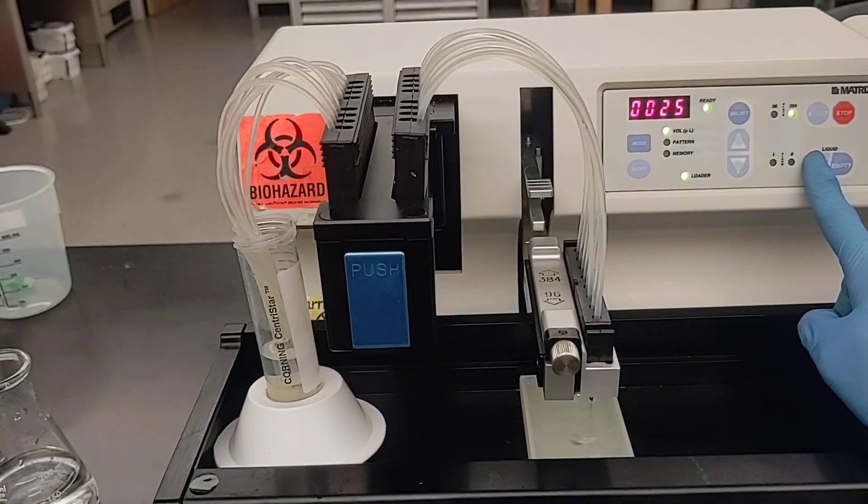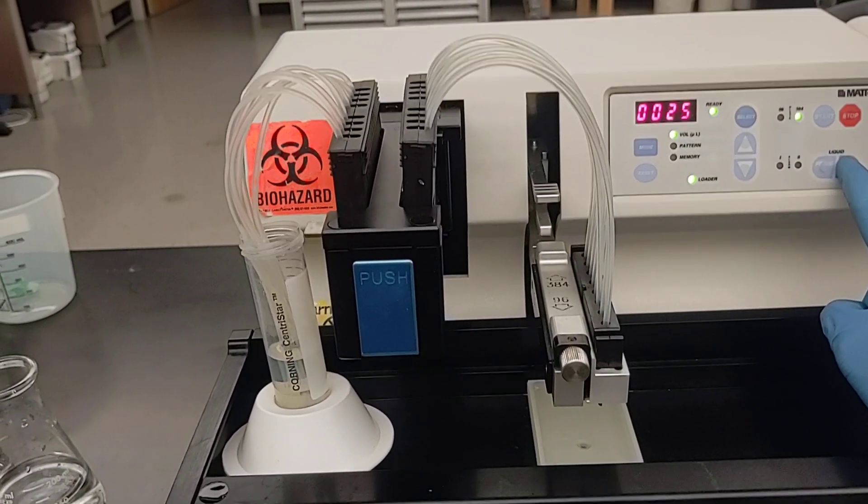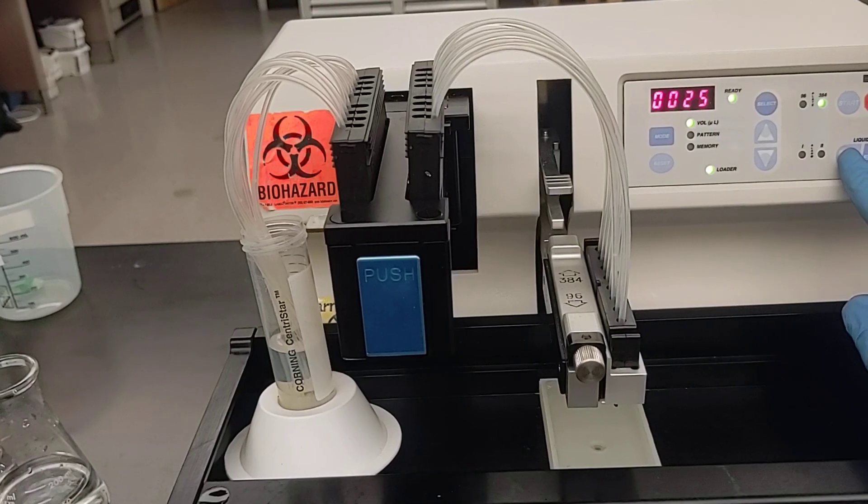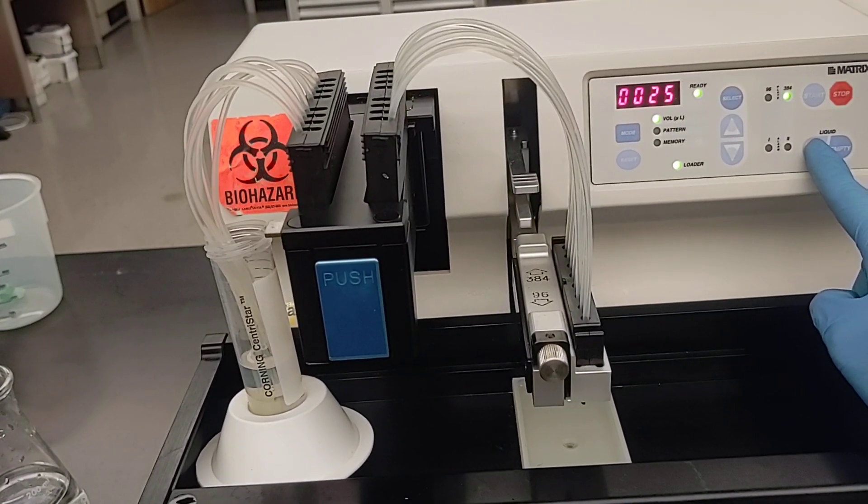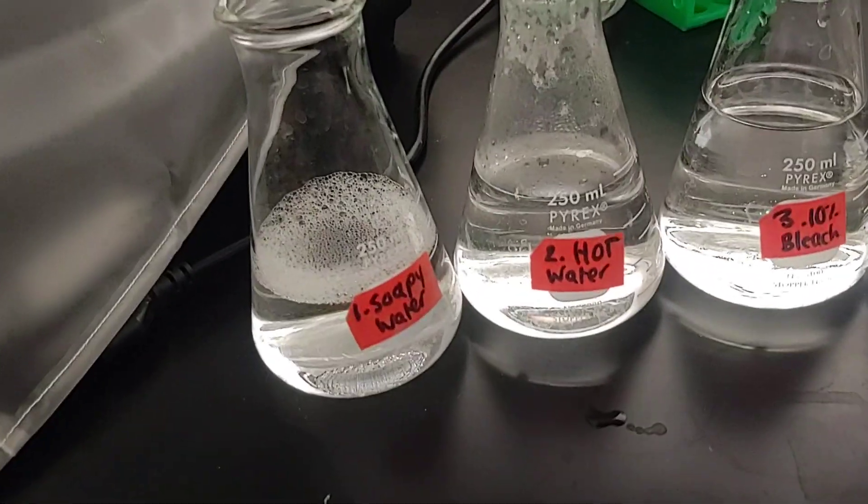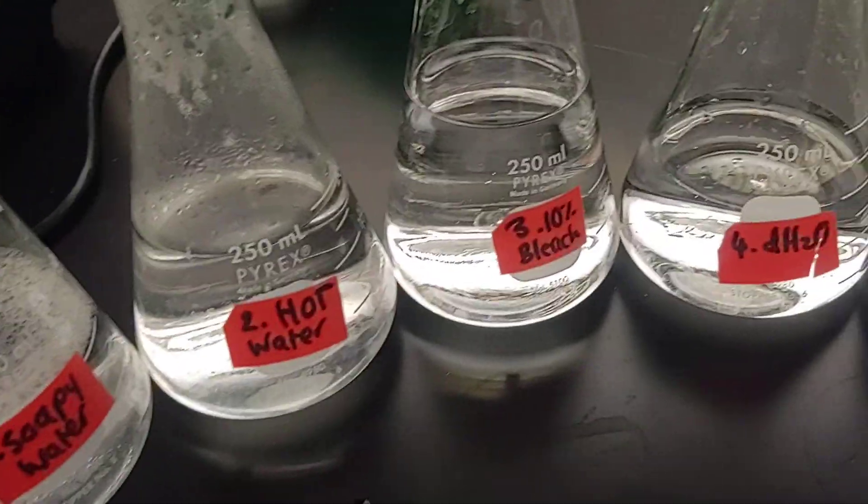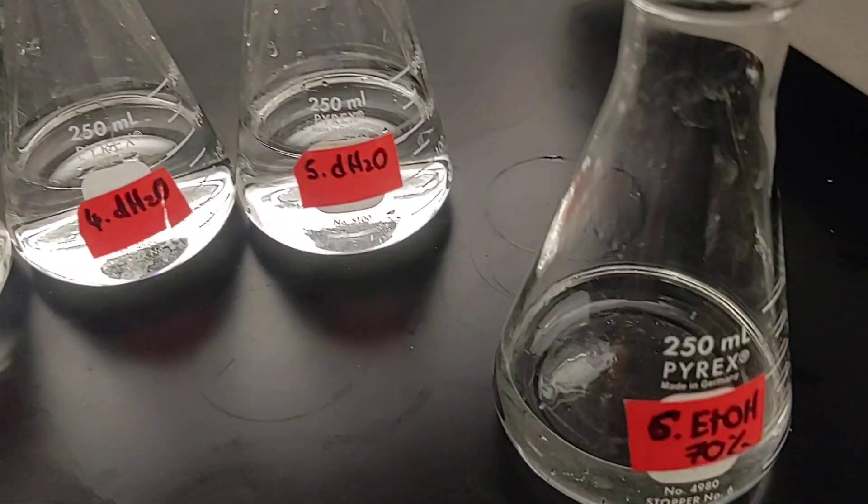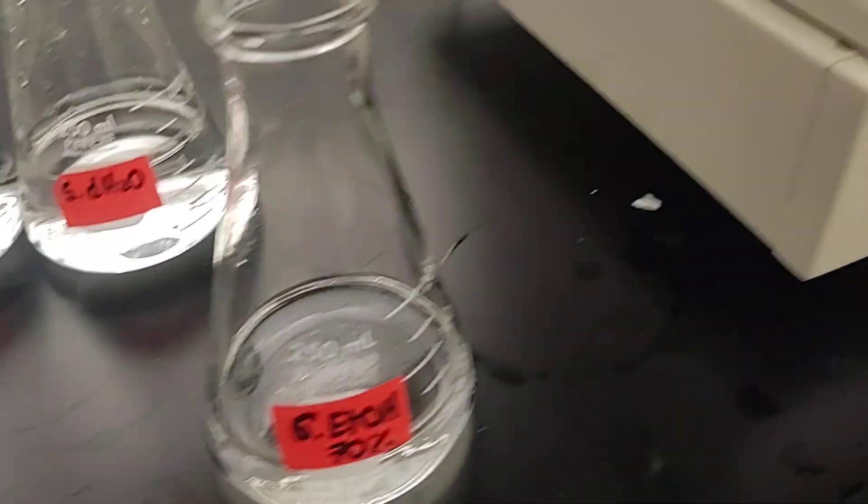And if you're washing, you can do a prime and then empty and prime three times with a sequence of different solutions to wash your tubing. We've got soapy water, hot water, bleach water, and then ethanol.